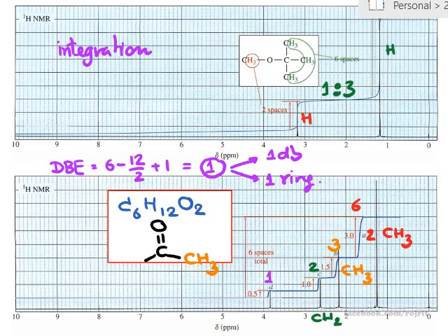And the other side here should be CH2. Okay. Now you can start connecting things together, right? So now we have black carbon, green carbon, yellow carbon, 3 of them, right? And you also have red color carbon atom as well. The red color carbon atom is only 1.